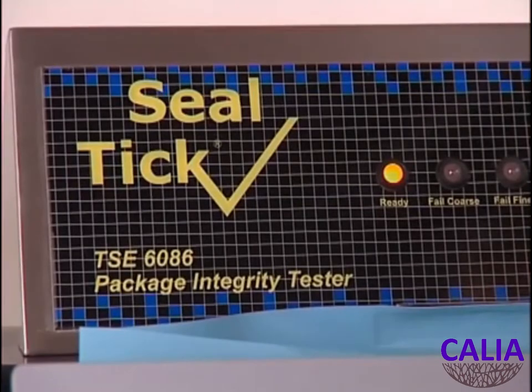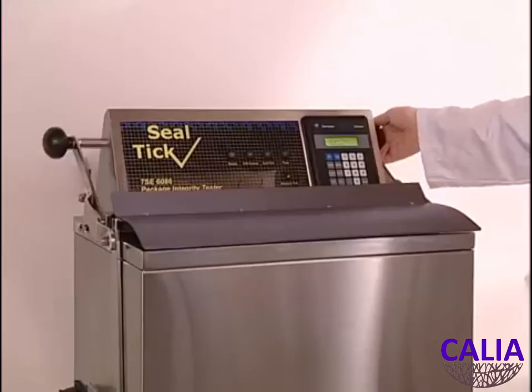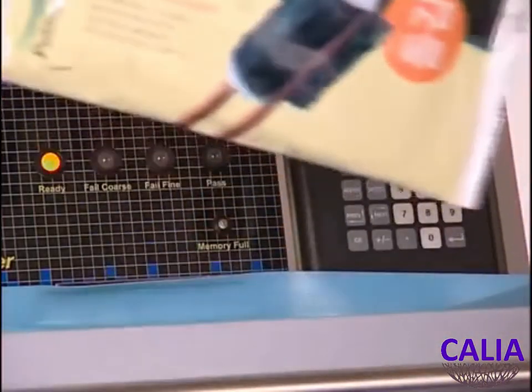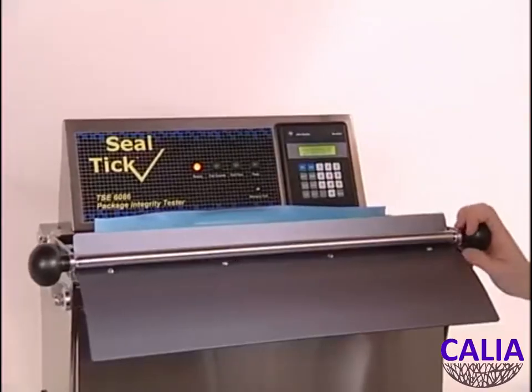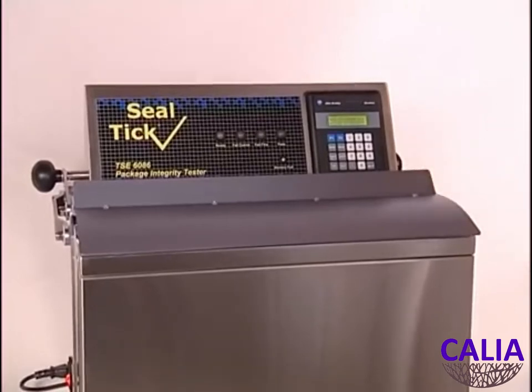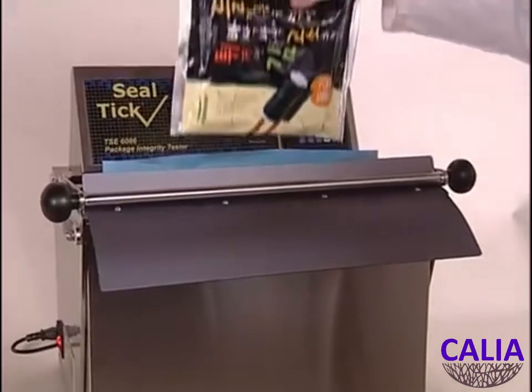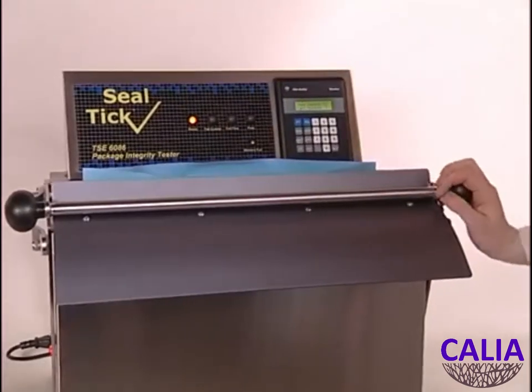The Sealtic TSE 6086 leak tester requires only air and power. Just switch on, open with the handle and you are ready to test. The pack is placed into the enclosure. The handle is closed and within a few seconds the panel indicates whether it is leaking. The green screen shows the value of the leakage. Repeated seal tests are performed by inserting new packs and opening and closing the handle.